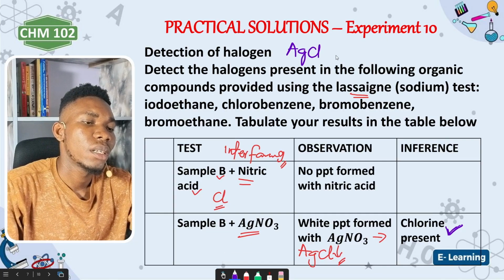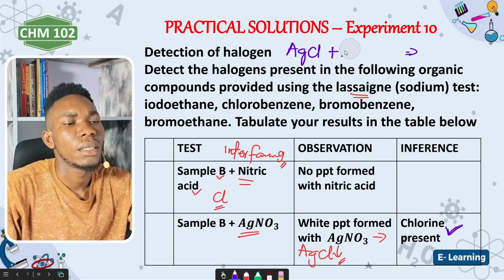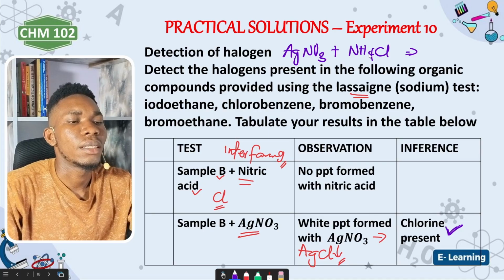It's something like this, plus ammonium chloride. Are you getting it? This is silver nitrate plus ammonium chloride.